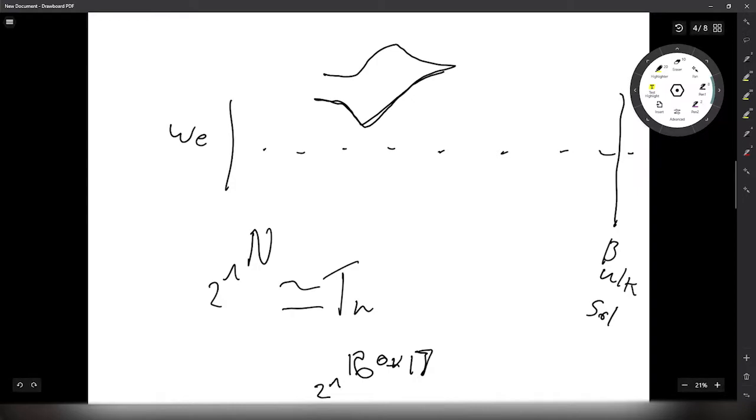the accuracy until you stop getting the exact same result. Because obviously you'll end up getting a plot where it looks like Y is the accuracy and X is 2 to the power of n. You'll end up getting something that looks like that, where this is just 100% accurate. You want to get close to this line, but not waste too much computational time.